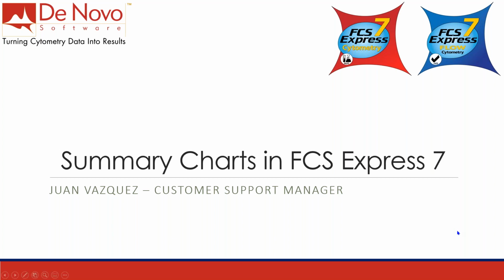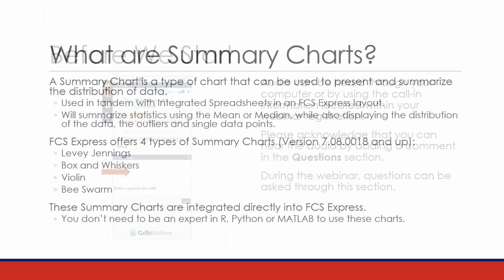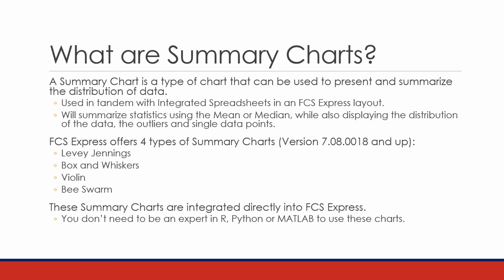Today we're going to talk about summary charts in FCS Express. For those of you that might not be familiar with the recent release of our most current update of FCS Express 7, we've included several new plot types. These are different charts that you can use with the integrated spreadsheet in FCS Express. They allow you to present and summarize the distribution of data that you're looking at.